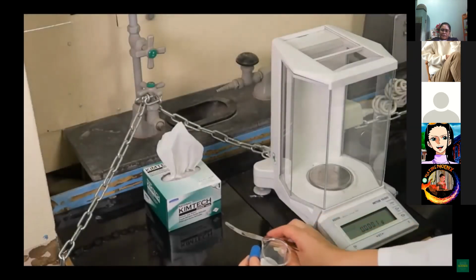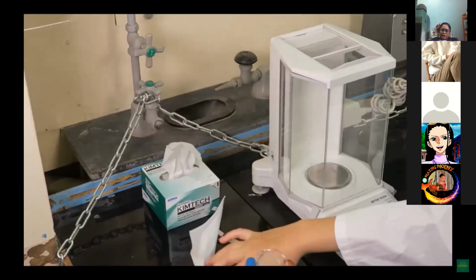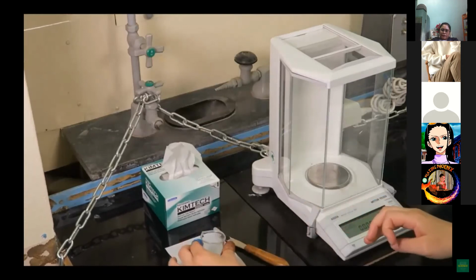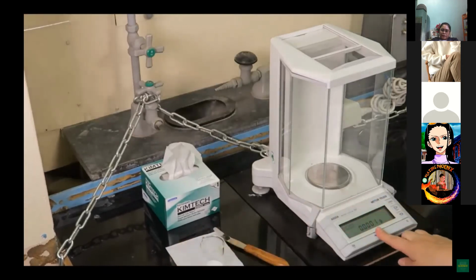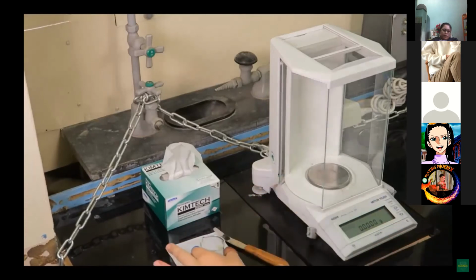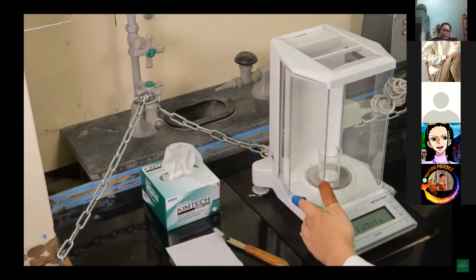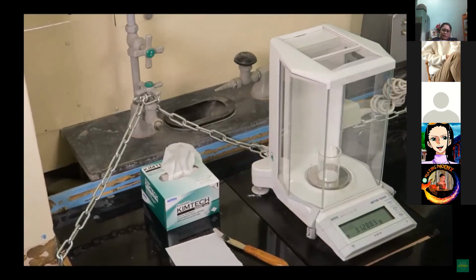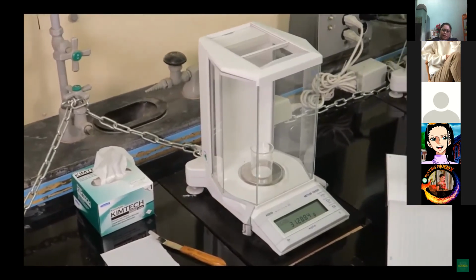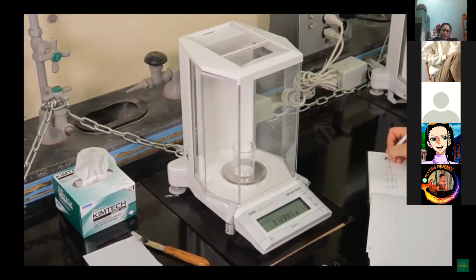Be sure to never touch the beaker with your bare hands. Repeat the steps used to measure the empty beaker. 0 the balance with the balance doors closed. Place the beaker containing the compound on the center of the balance pan. Gently close all doors and wait for a stable reading. Once a stable reading is achieved, record the mass of the beaker and compound in your laboratory notebook.